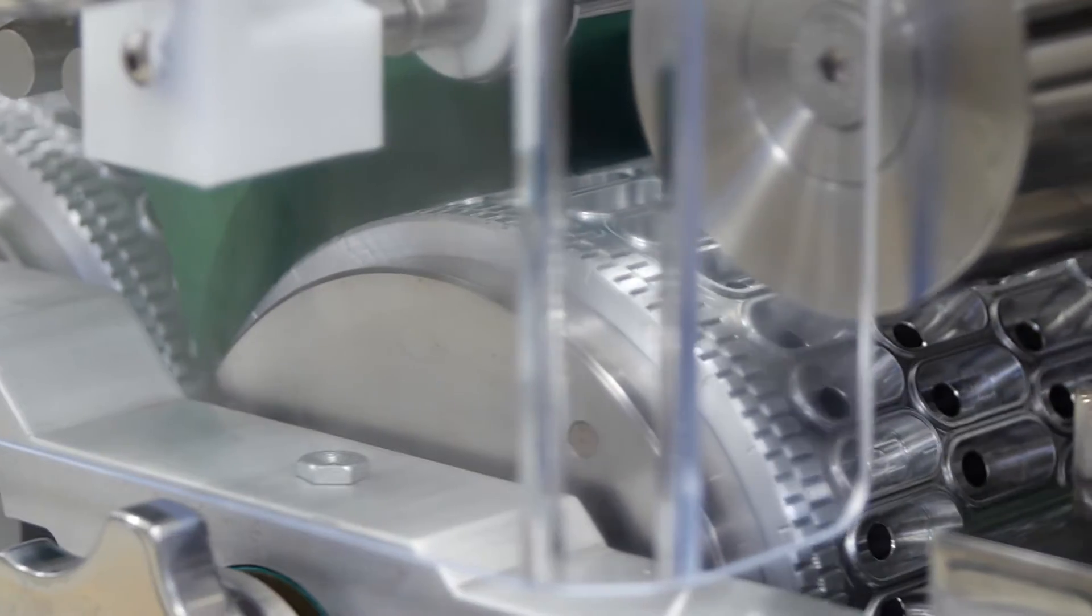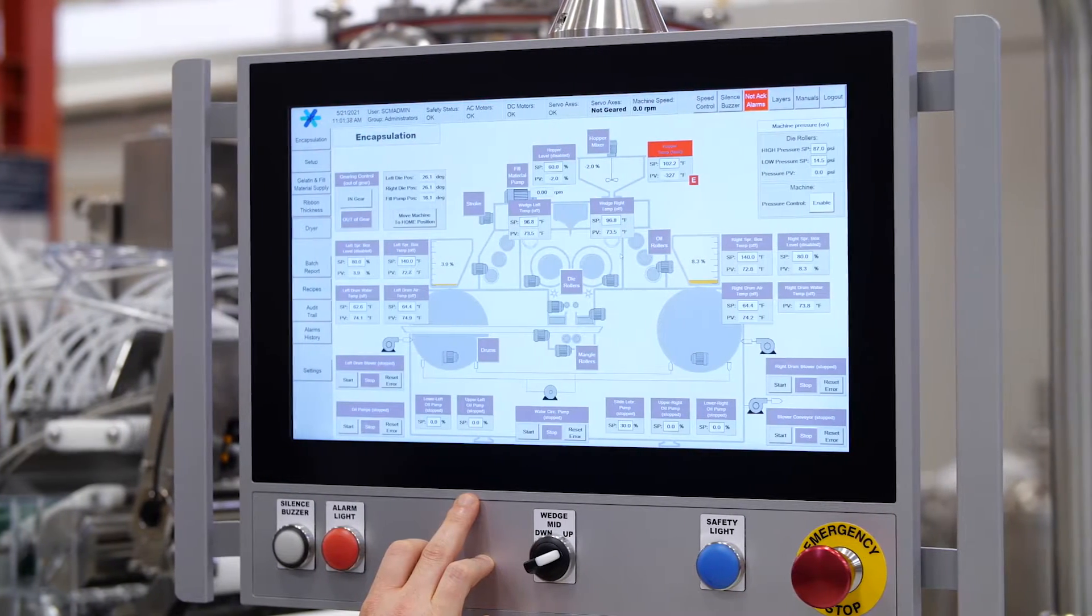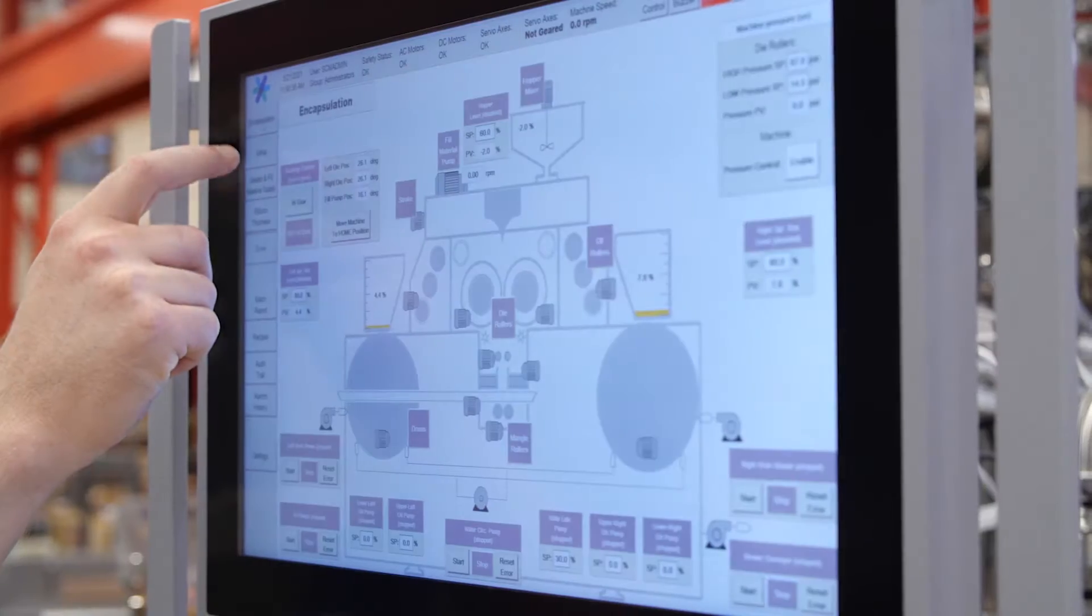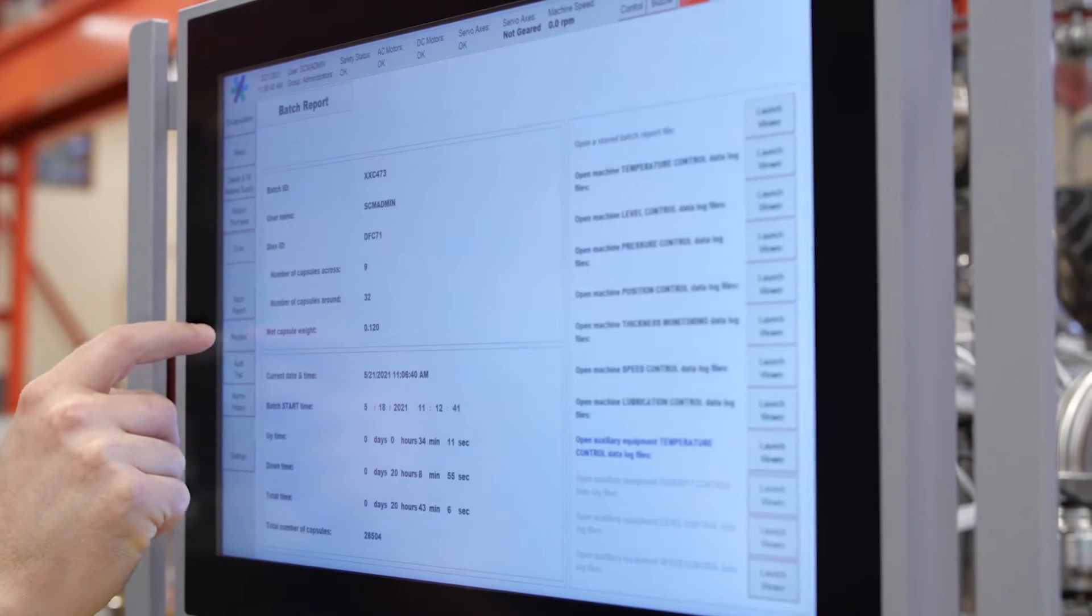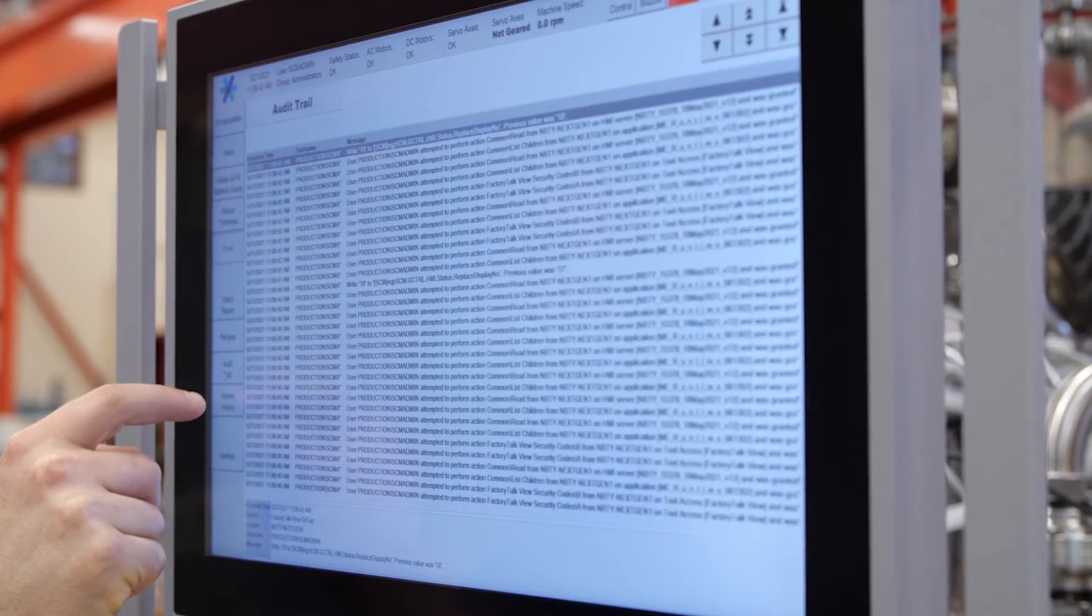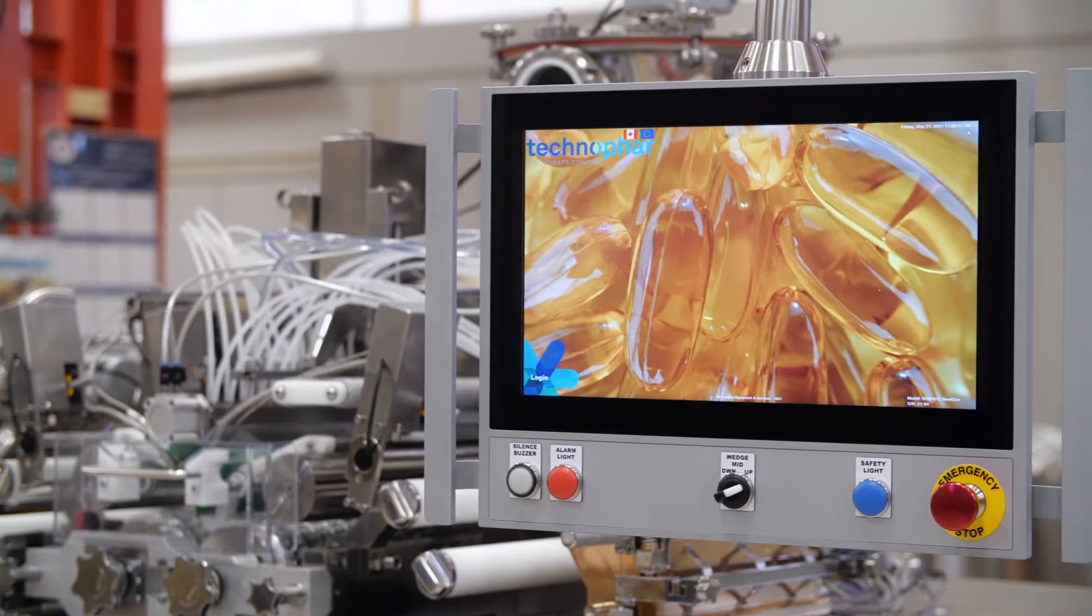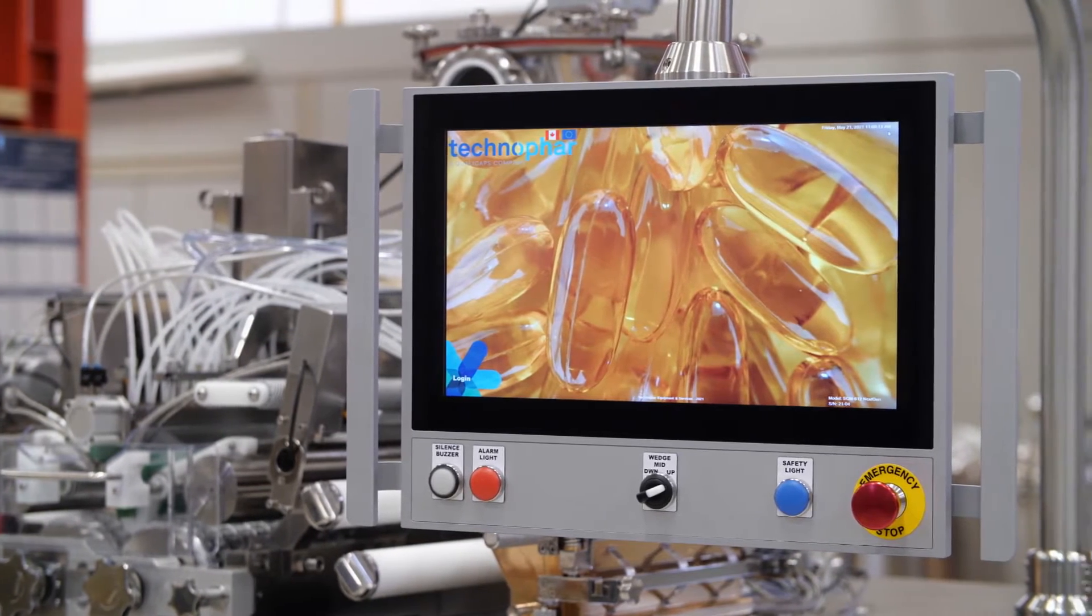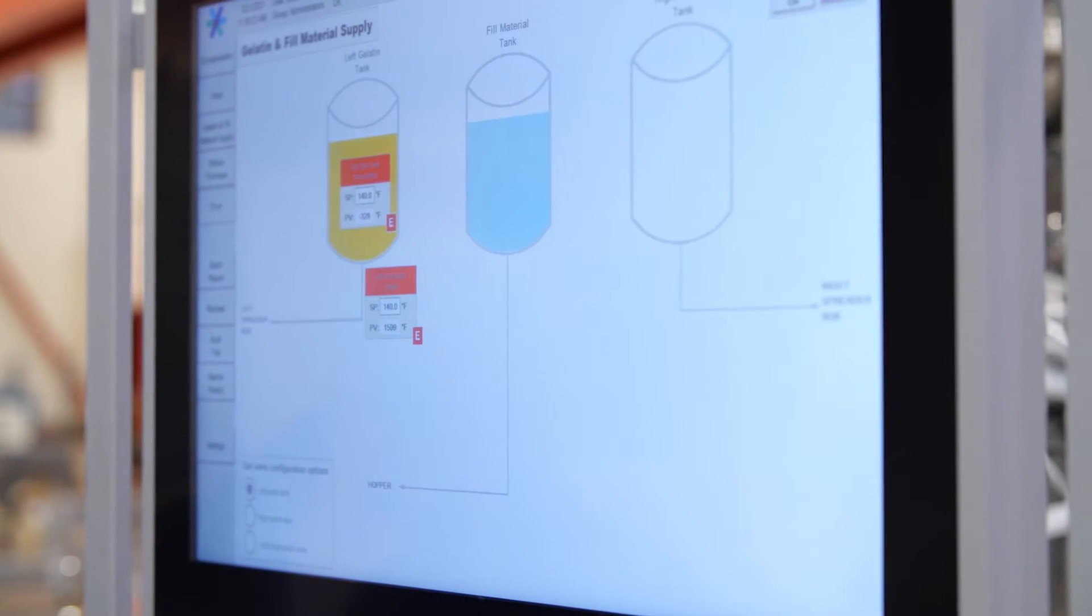So where does the encapsulation process begin? With the machine's PC-based control system embedded PC with technology and safety integrated, as well as a PC-based visualization system IPC with runtime software and industrial monitor. This screen allows the operator to view and control every step of the process, from production recipes to output speed.